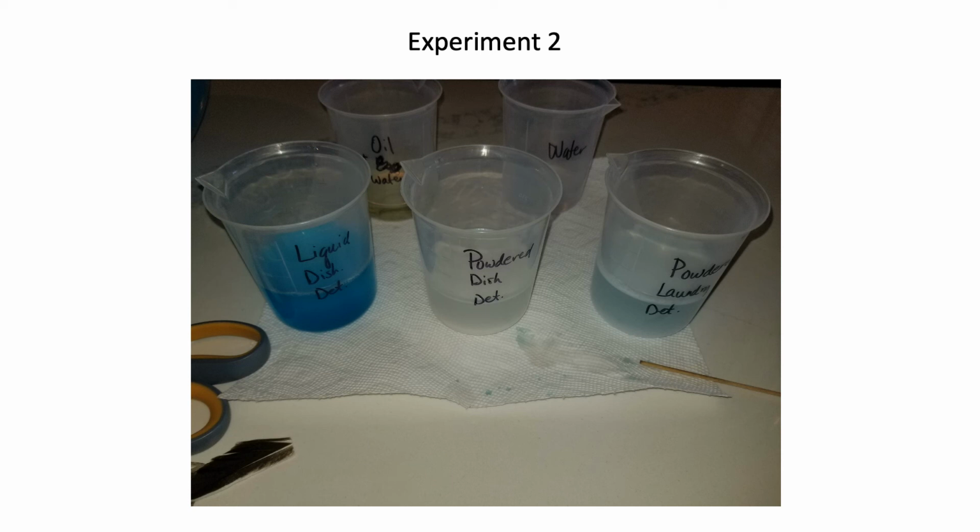The liquid dish detergent, powdered dish detergent, and powdered laundry detergent were mixed with water so that we could create a solution of those detergents. You can read through steps 5, 6, 7, 8 for setting up those specific treatment groups.